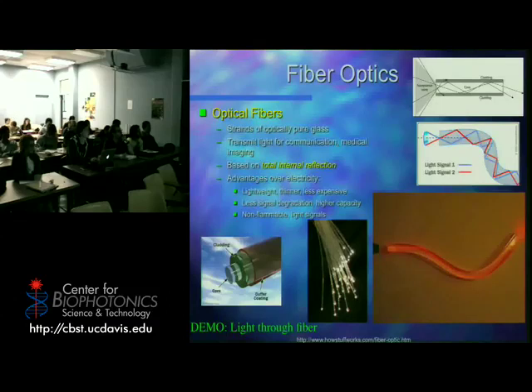What that means is that I can shine light into a fiber. Think of this middle part here, the core, as the glass part. The cladding is just the plastic that goes around it. It can be made of different materials. And no matter if I've got a laser coming in at this angle or at this angle, they will all be accepted, and they will bounce inside that glass fiber until they come out the other end. Now, so what? I could have just shot it straight.